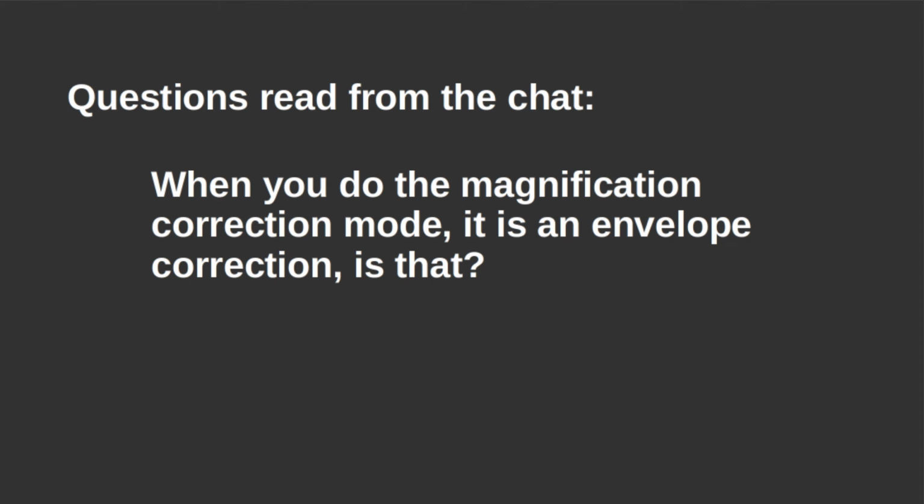Well, not really. I think it's very simple. I do not remember how exactly this is implemented, but we just multiply with itself. Basically, that's how it works. So I'm not sure about the envelope. I think the envelope one is still a bit more sophisticated than what we do.